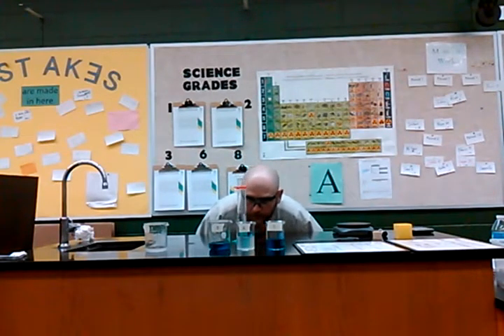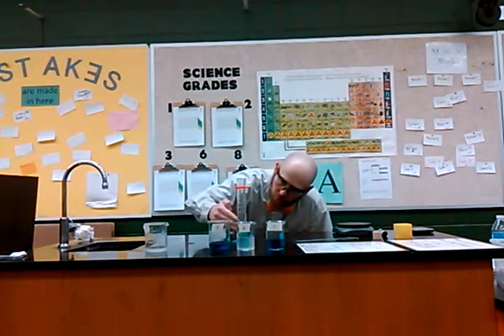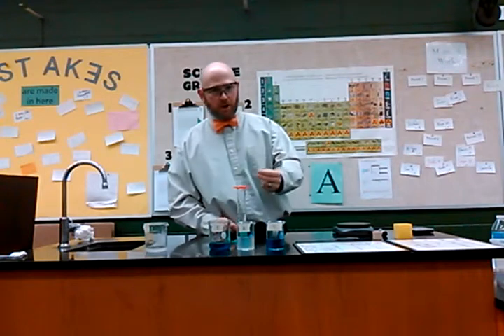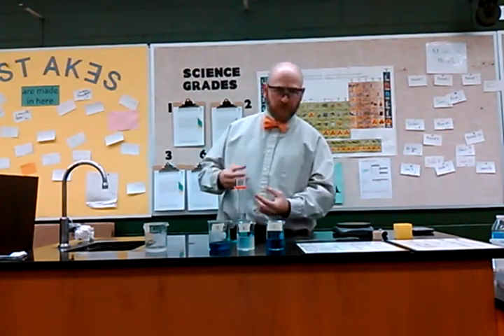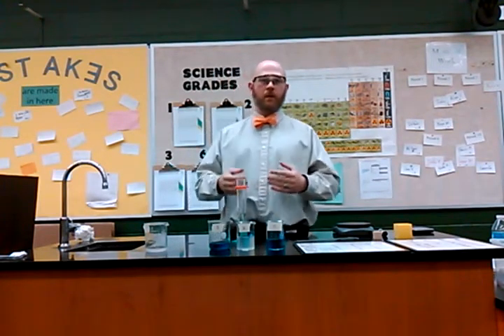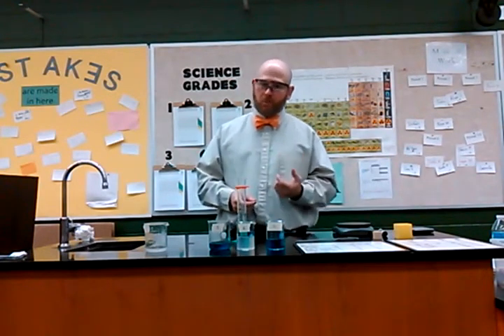Once I place it into the graduated cylinder, the water level now reads 57 milliliters. So take our starting level and subtract that from our finishing level of 57, and we now have how many milliliters of water this displaced. This displacement in milliliters is equivalent to cubic centimeters.